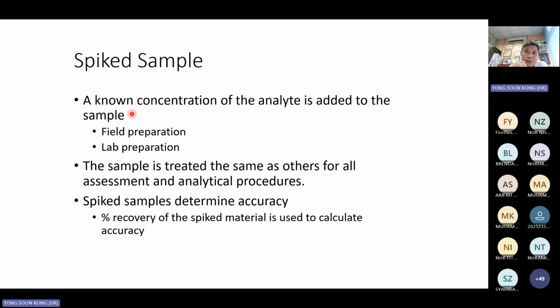So water group, Amira, pay attention. Benda ni masukkan. Walaupun saya tak rasa awak kena buat, tapi awak tengok balik. Which of the 6 water quality parameters that you can do this, the spike sample? Because otherwise macam tak ada kan.